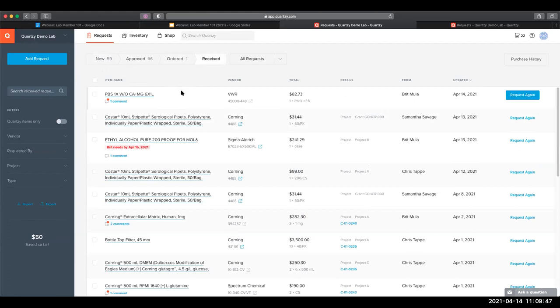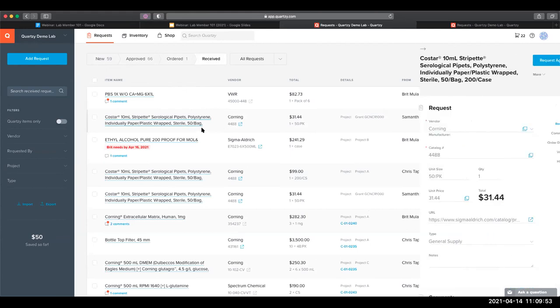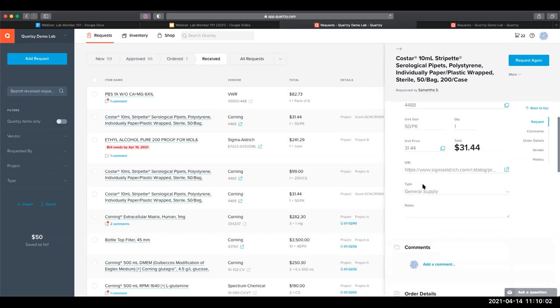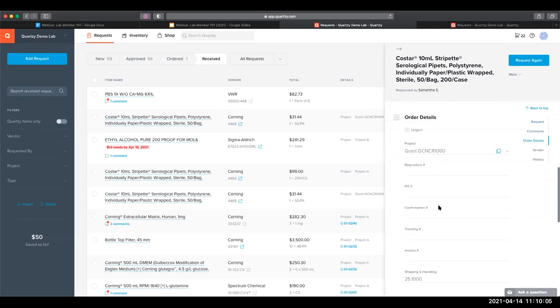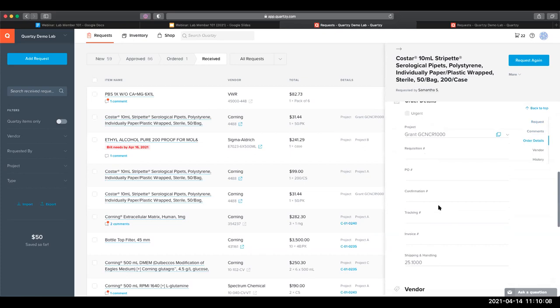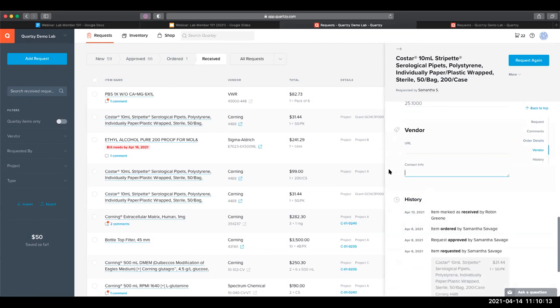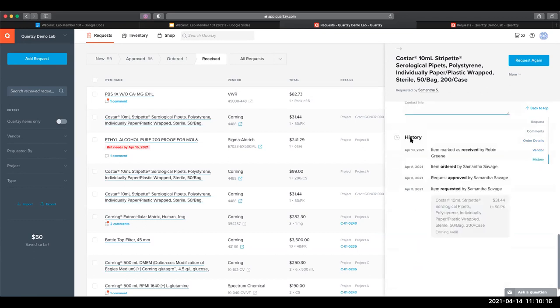This Received tab will list the orders that have been through the full ordering and receiving process. Let's take a look at one of these. Clicking on the item name will bring up this item detail panel, which will show first all the request details, then followed by the order details. There's a vendor section below that where you can add any kind of contact information. And then we'll have a history section which lists the most recent to the oldest action. You can see that this was requested by Samantha, then ordered by her as well, and then Robin Green marked this as received.